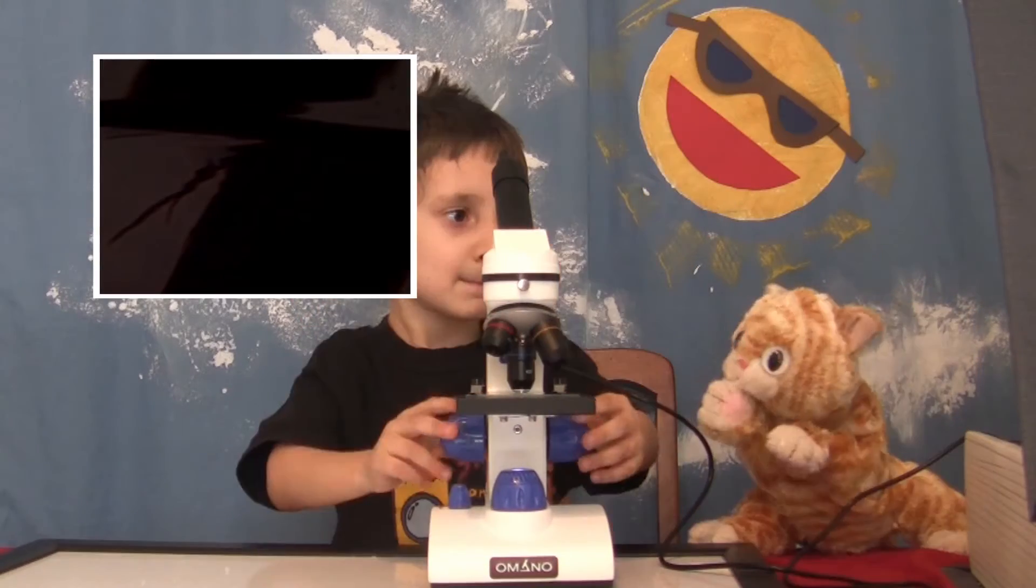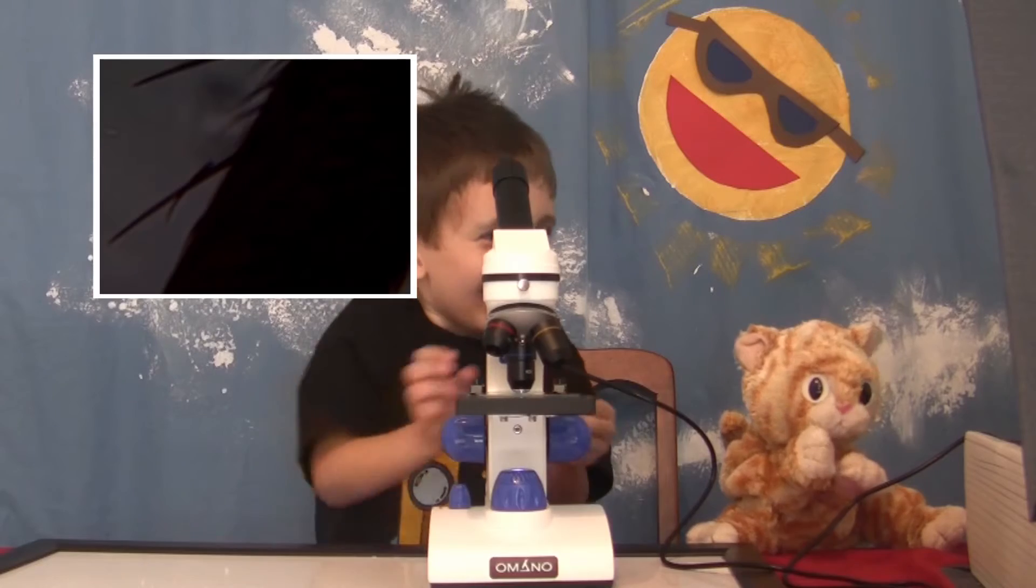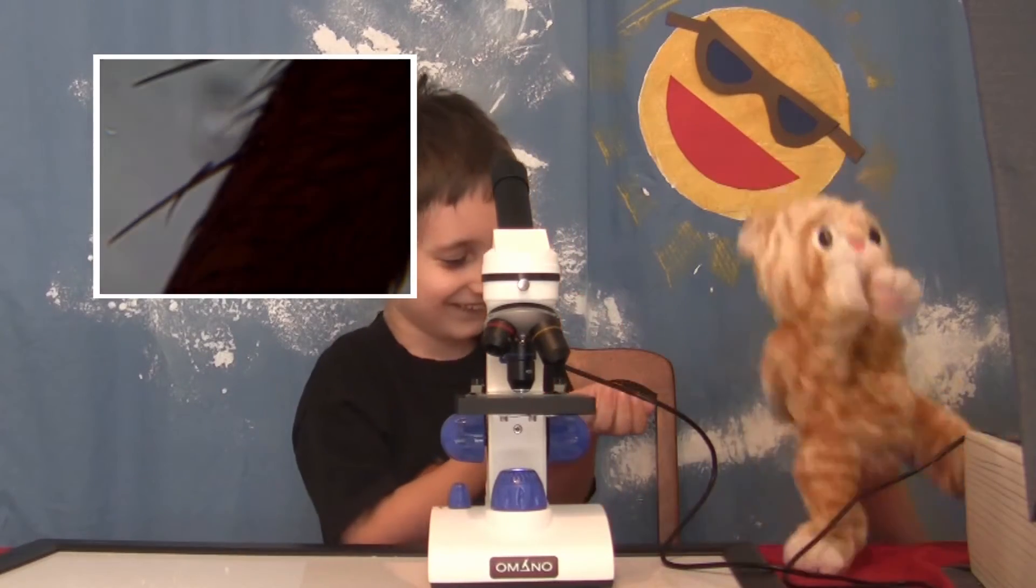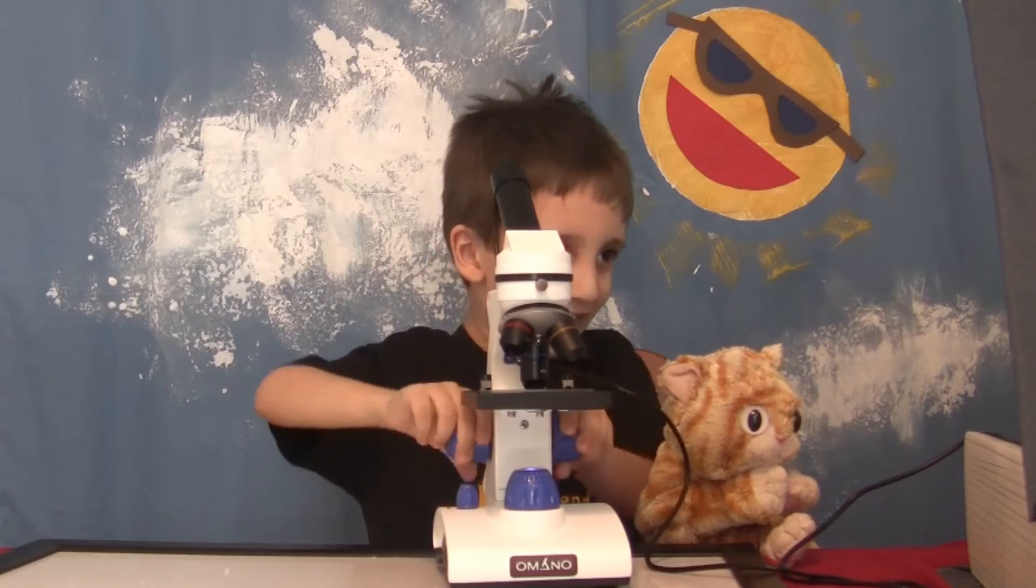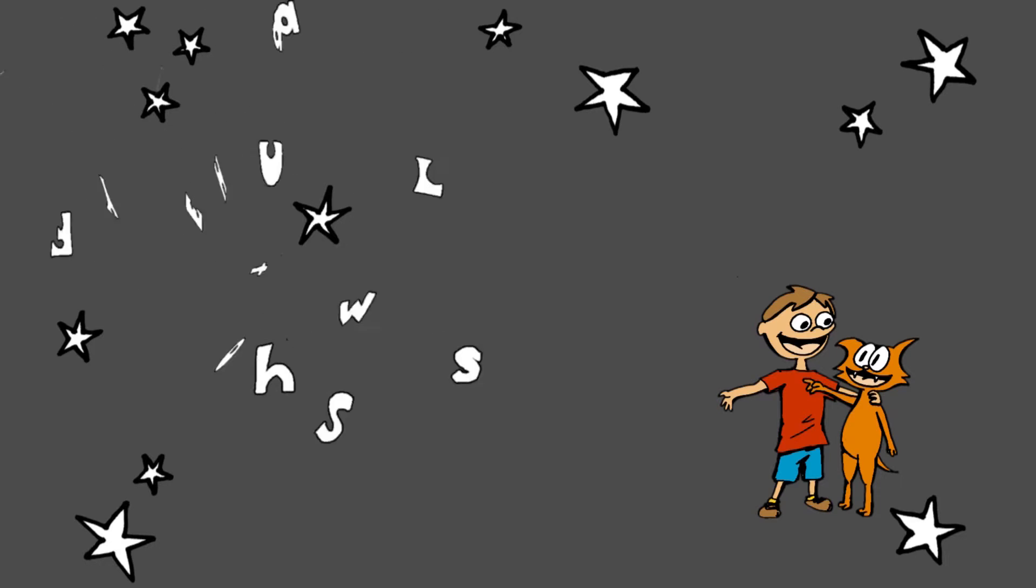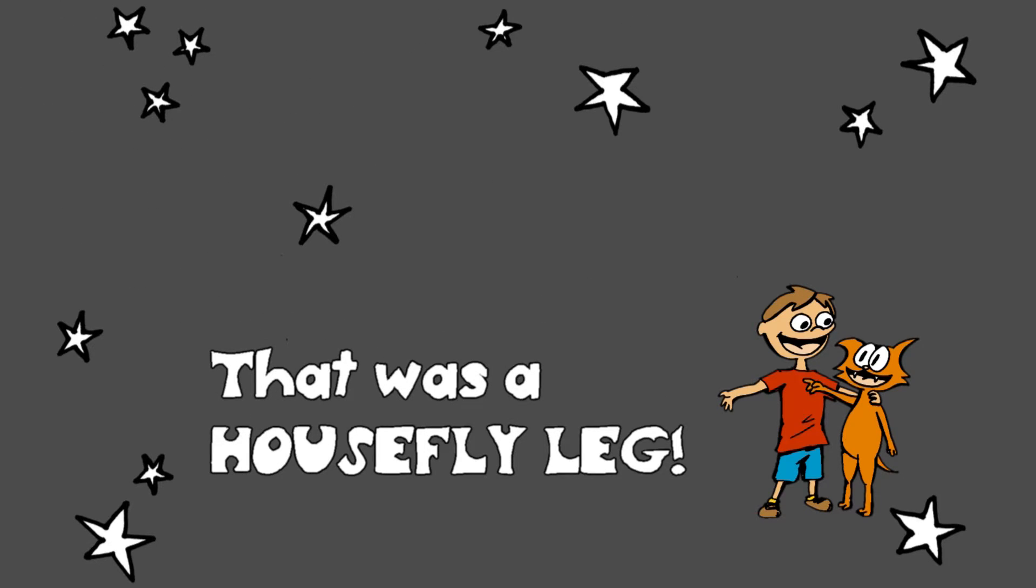This is gonna be so eww. So, so eww. Eww! Gross! Gross! That is disgusting! I don't want that! I didn't know they were so hairy! We looked at all stuff in the microscope! Kids! You can do it!